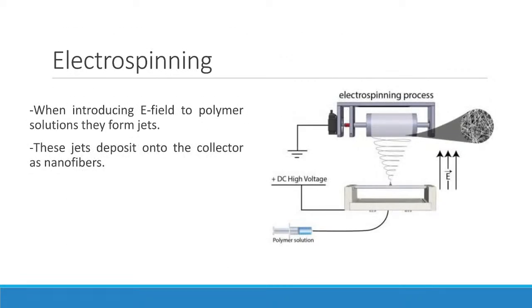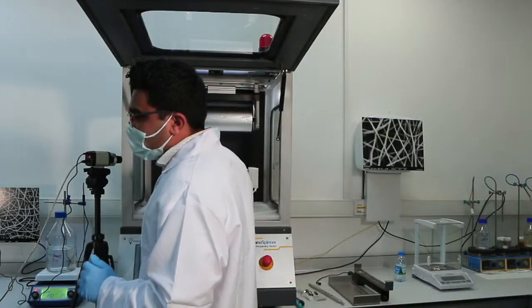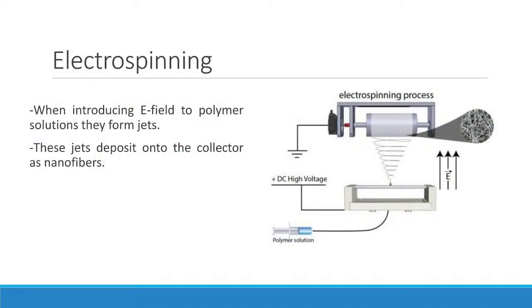Electrospinning is essentially when you have a polymeric solution and you are inducing high charge onto it. The charge accumulates and causes the solution to become charged and unstable, and it is emitted as a spray. That spray travels through the air and starts solidifying onto the collector. The end product of this is the nanofiber, or rather a mesh of nanofibers, as you can see in an SEM image. We can move on to the next slide.